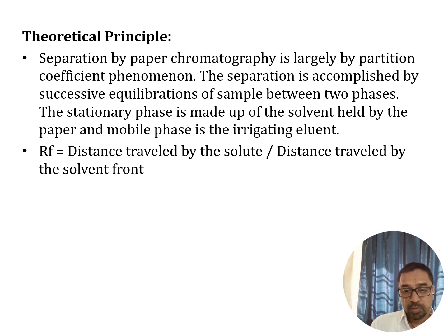The basic principle of this technique is based on partition chromatography. The separation in chromatography is based on the partition coefficient phenomenon. In this technique, we need to measure the Rf value, that is the retention factor, which can be calculated by dividing the distance traveled by the solute by the distance traveled by the solvent.